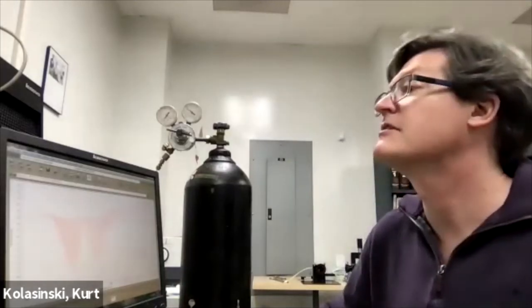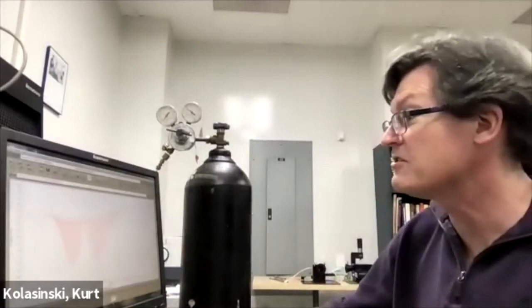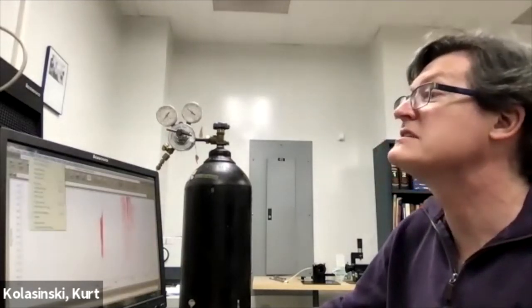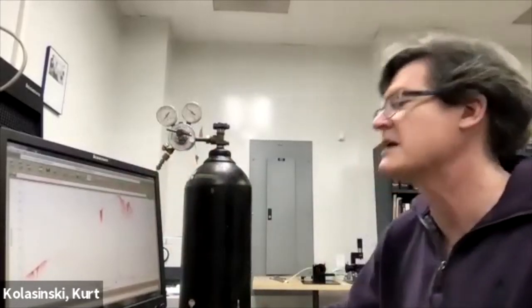If you have multiple spectra and you save as, it doesn't save all of them, it only saves the one that's in red and it only saves this region. Even though there's all this other data that you took, be careful. If you select just that portion, it's only going to save that portion. Be careful about that. Save it as a CSV file. For the data files that you need, save the background as an SPA because it needs that for being able to use it as a background.